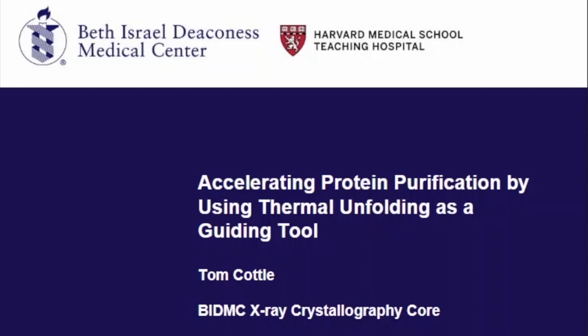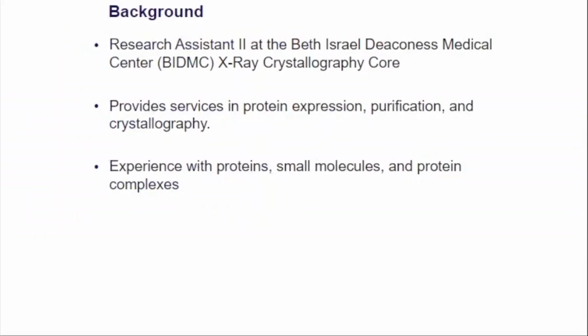I'm going to go over today a presentation that I call Accelerating Protein Purification by Using Thermal Unfolding as a Guiding Tool. Very briefly, I'm a research assistant at the BIDMC X-ray crystallography core. What we do here is provide services in protein expression and purification and crystallography. We have lots of experience working with proteins, working with small molecules, and creating protein complexes.